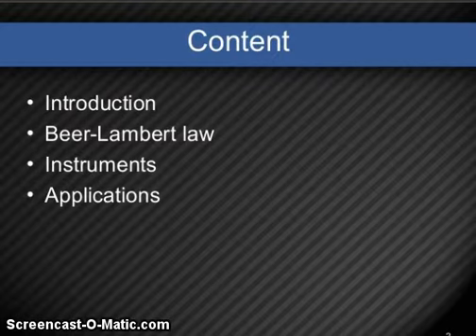Today in this video, I am going to talk about spectroscopy, especially UV visible spectroscopy. So, the content of today's talk is introduction, Beer-Lambert's law, instruments of UV visible spectrophotometer and their applications.